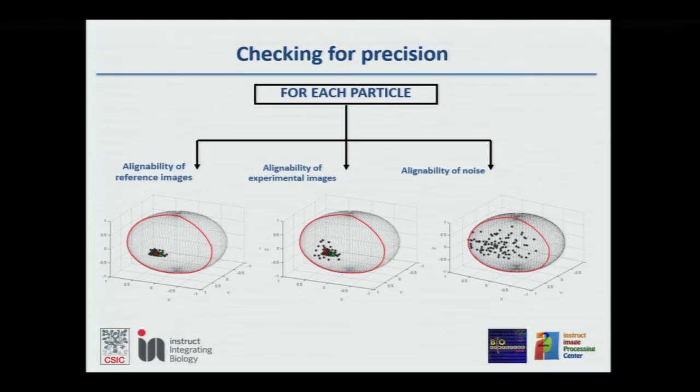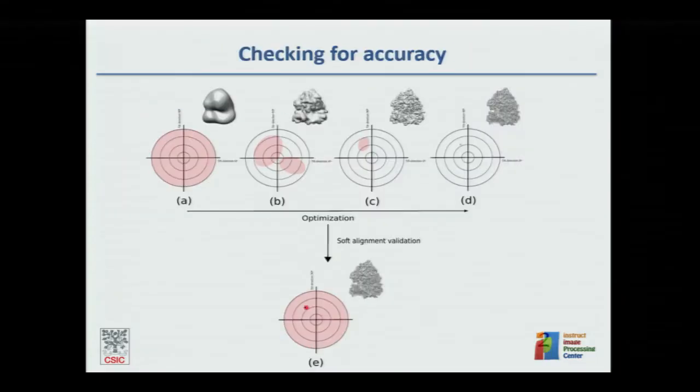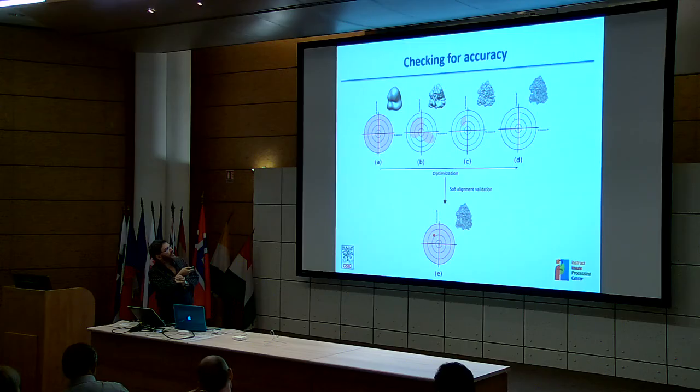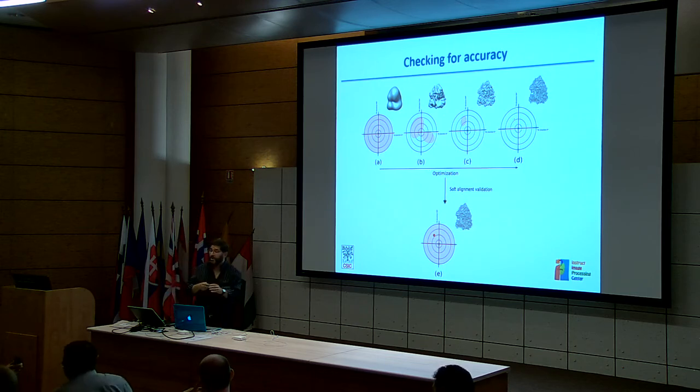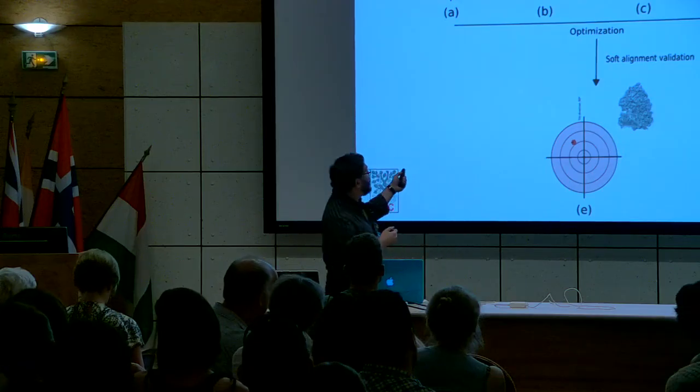I have a fundamental question about that method. Yes. How can you measure accuracy if you do not know the true orientation? Oh, okay. I didn't get into the accuracy, sure. I get into the precision. The accuracy part is a much more tricky thing. But basically what we were doing here is checking the consistency of your map, that was one of the solutions, with a coarse screening, a full screening at reduced resolution of the whole search space.